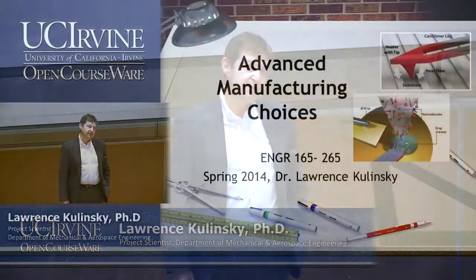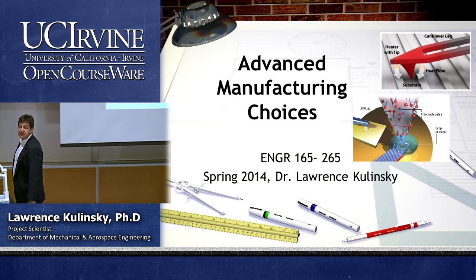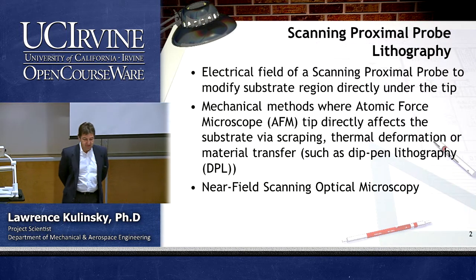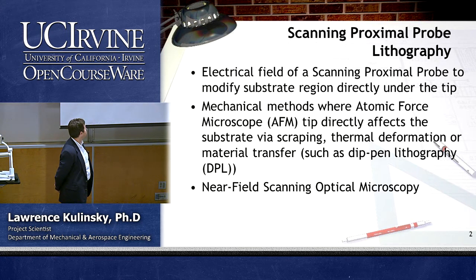Today I'm going to talk about proximal probe microscopy and lithography. So we're going to talk about three different types of scanning proximal probe tools.